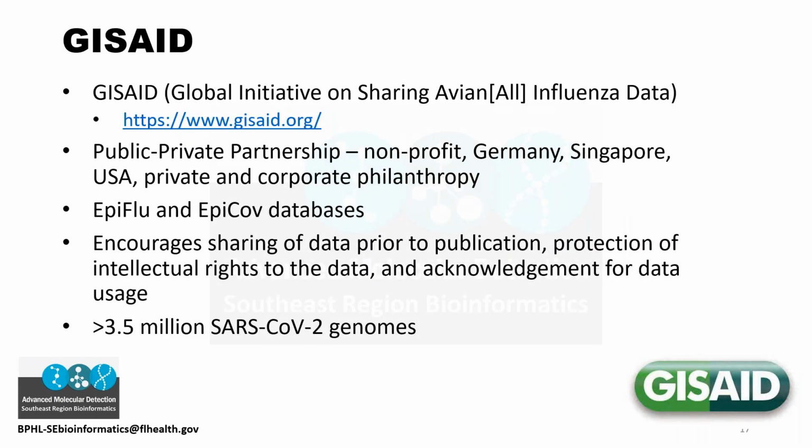First, I've been mentioning GISAID several times, and just in case someone is not familiar with it, I'm going to go over it really quick. Most people are familiar with NCBI, but GISAID stands for Global Initiative on Sharing All Influenza Data, and it started out of necessity to help track influenza data. It's now being used to track SARS-CoV-2 data, and I believe they've now started a database for RSV as well. I've included the link here, and I'll be doing a short demo to show you how to pull some information from it.